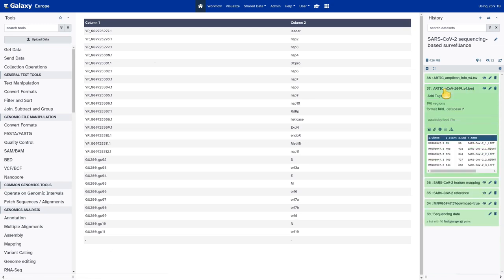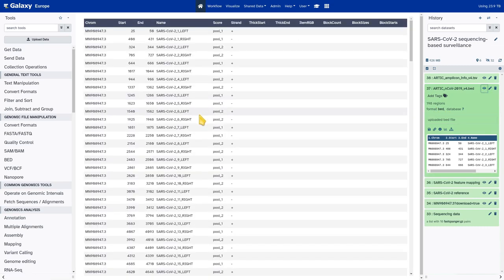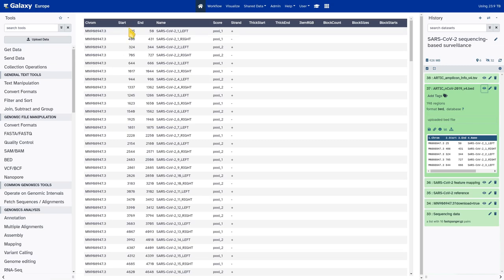I've also uploaded the primer information in BED format — it's important that this dataset format is set to BED. Looking inside, this dataset describes the different primers used in the ARTIC V4 primer set for the tiled amplicon amplification. It lists one primer per line, where it binds with respect to the SARS-CoV-2 reference sequence, the name of the primer, which amplicon pool that primer belongs to in the fifth column, and in the sixth column the strand on the reference genome that this primer is supposed to bind on.